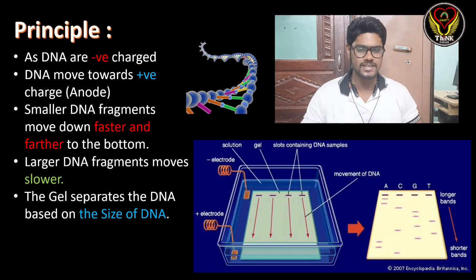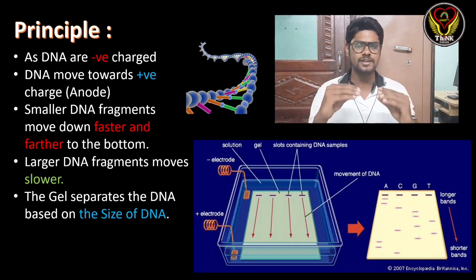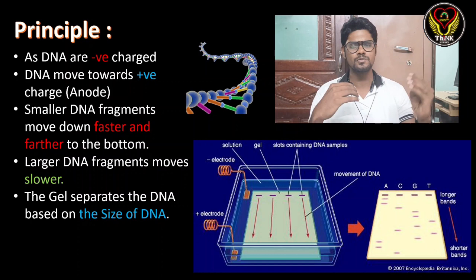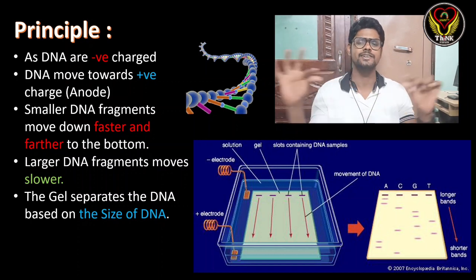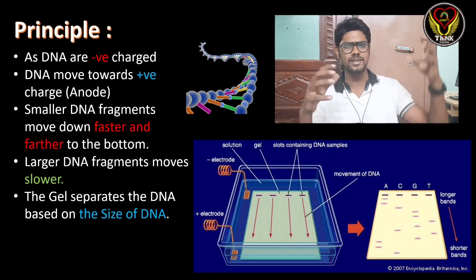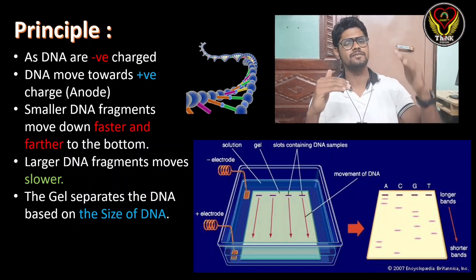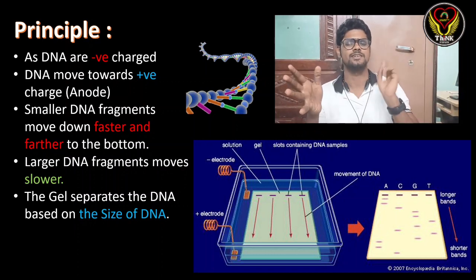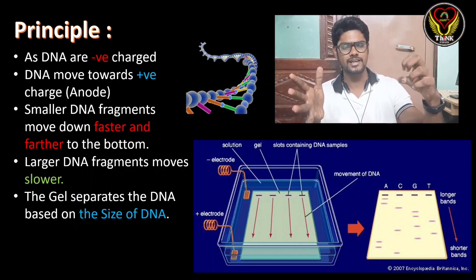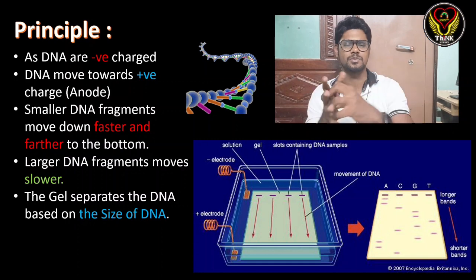The principle of this technique is very simple. DNAs are negatively charged molecules. They have a phosphate group which is negatively charged, so all the DNA molecules are negatively charged. What happens is, when we apply electric current, DNA will move towards the positively charged electrode, which is the anode. This negatively charged DNA will be attracted towards the positive charge.